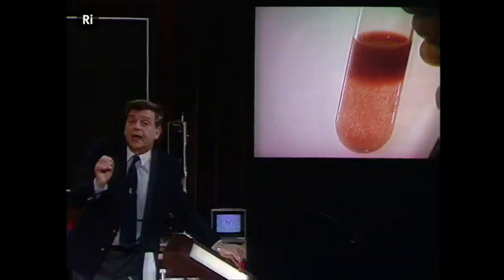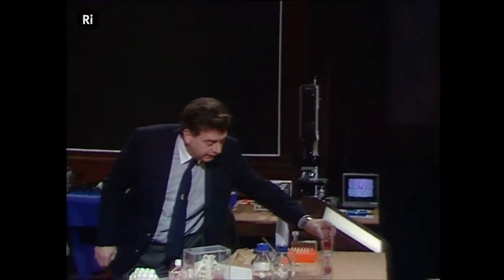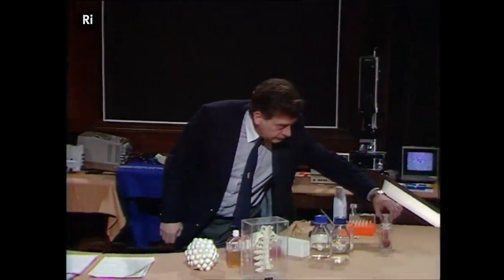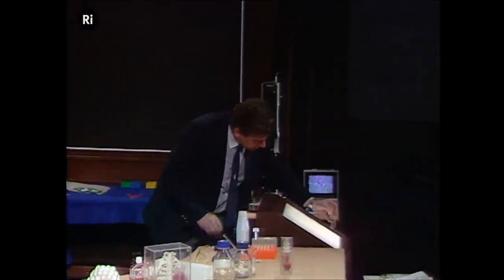Now, if we help that process by spinning that tube in a centrifuge to let things settle out quickly, then we get the following result. This is what we get. The final process. Now, can you see that?